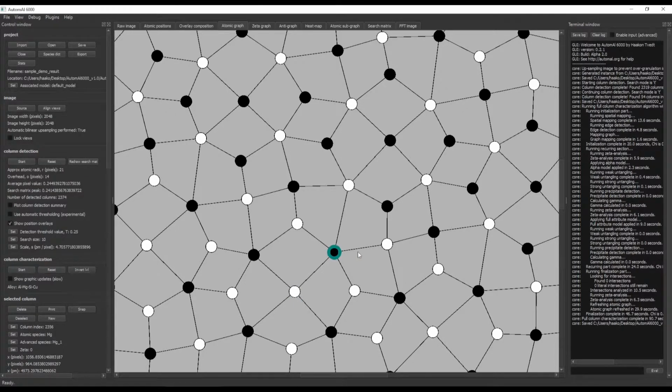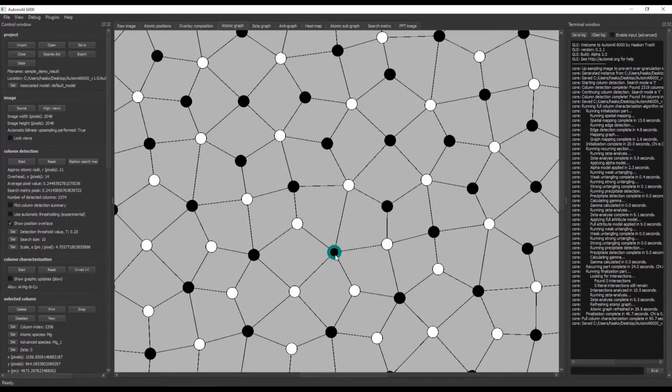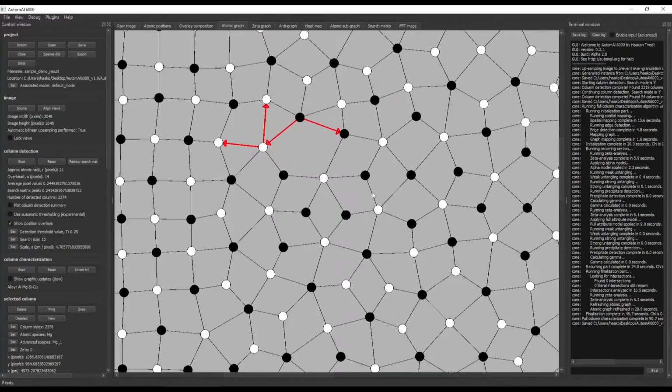So this means that, looking at this, I don't have to actually go and check the label to see if this is in fact magnesium. I know that because only magnesium has 5 edges. And so this is the kind of principles that you have to rely on.